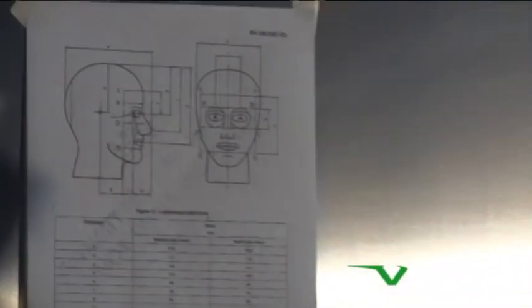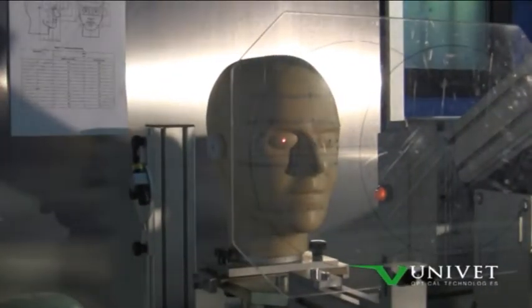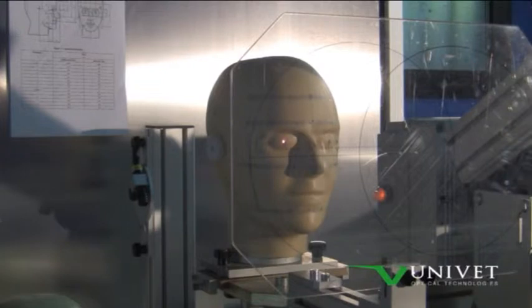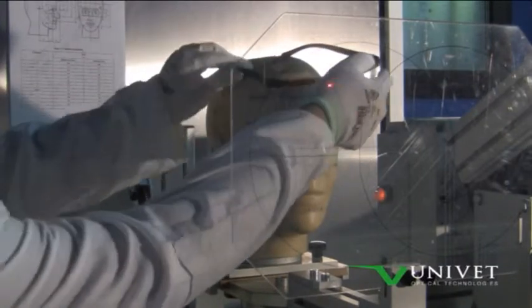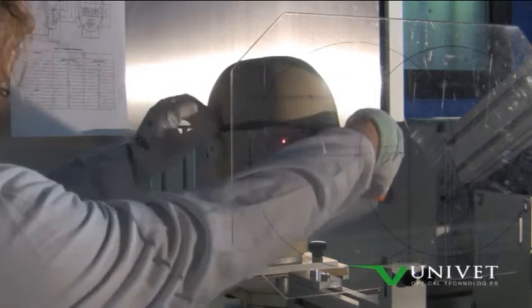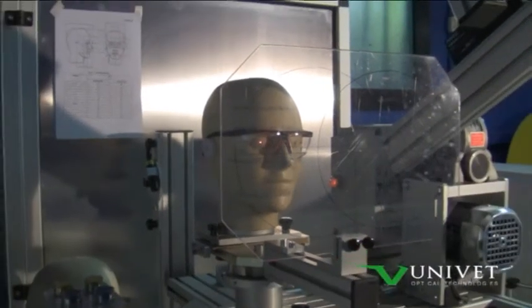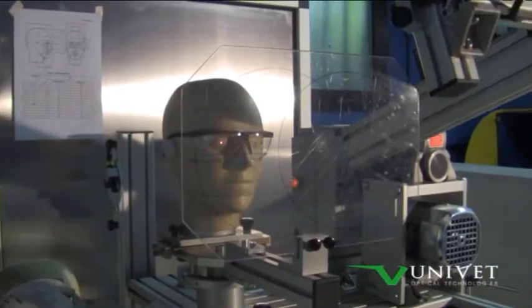A protective device is effective when the operator who wears it is protected from the type of risks to which he is exposed. In case of potential mechanical hazards, it is essential to have the PPE designed with an adequate coverage in order to guarantee the maximum safety to the wearer.